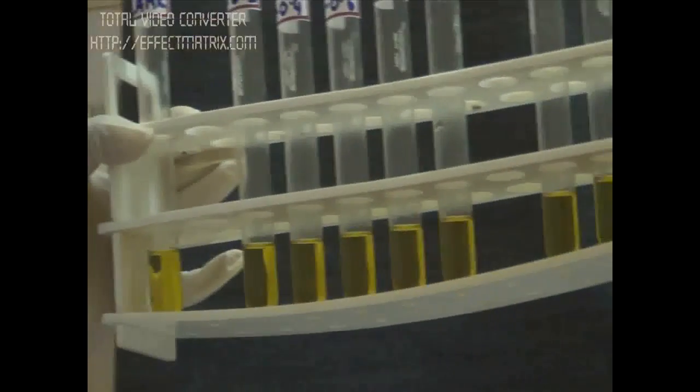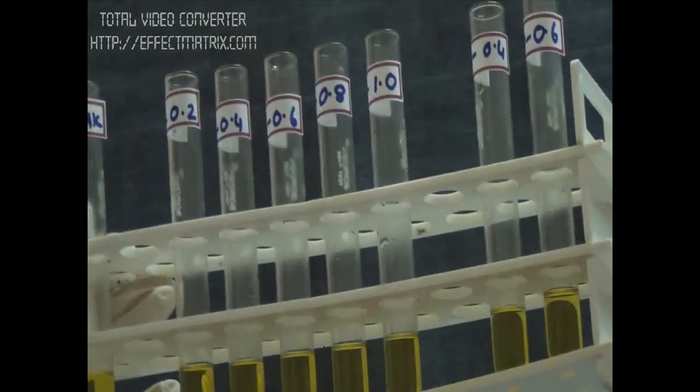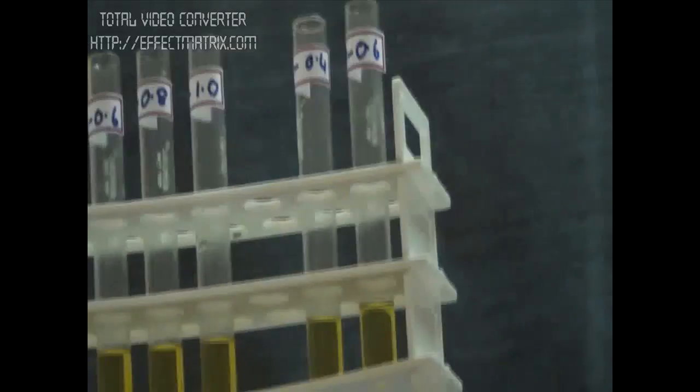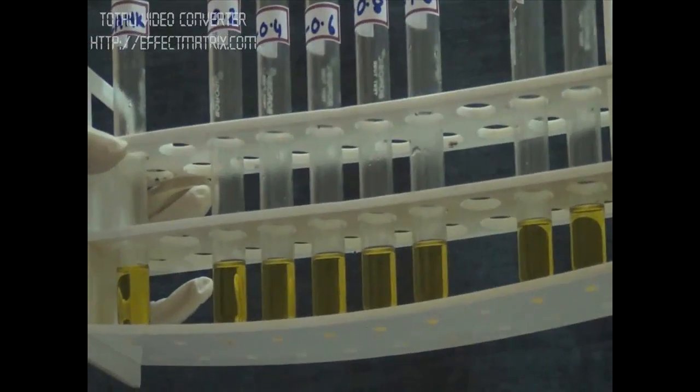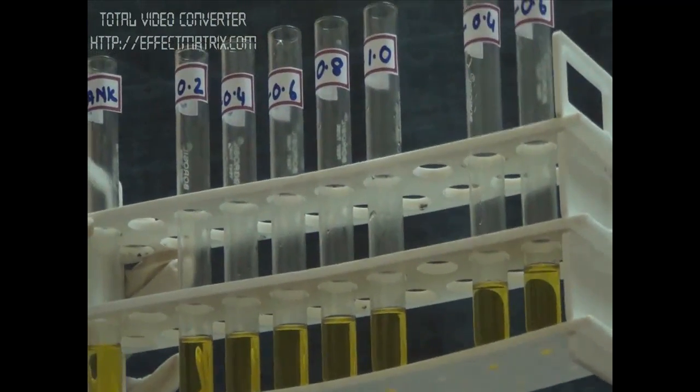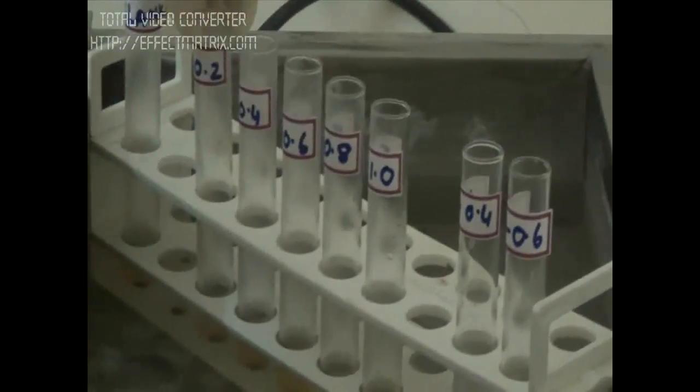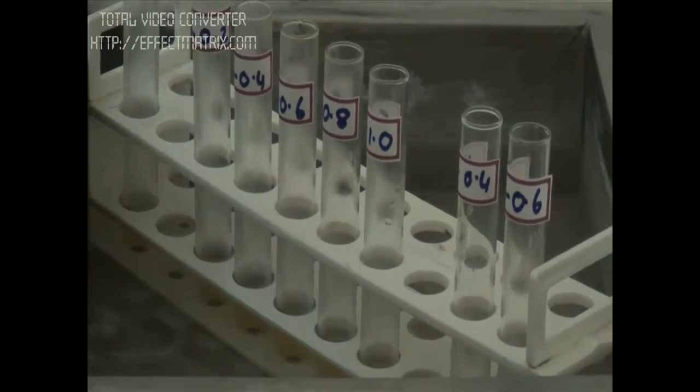We have added acid in the reagent already, so the conversion of ribose sugar to furfural has started. And now when we keep it in the boiling water bath, it will start reacting with our reagent orcinol and we will start to get the greenish color to standardize our RNA sample. Now we have to keep all the tubes in boiling water bath for 15 minutes.